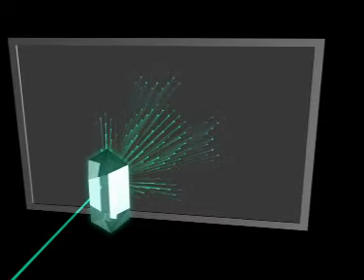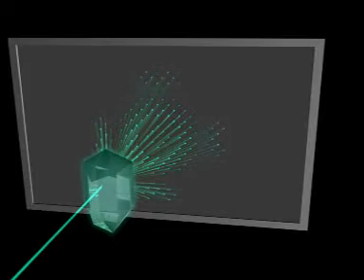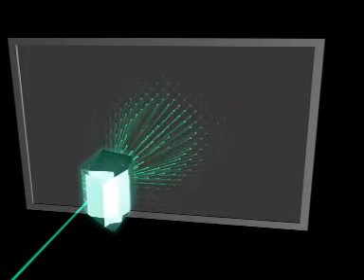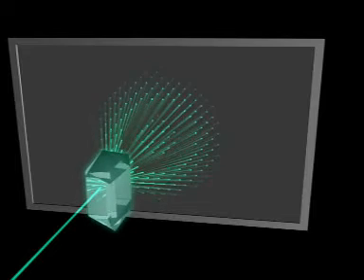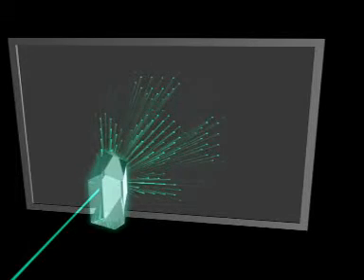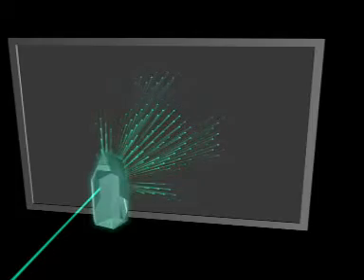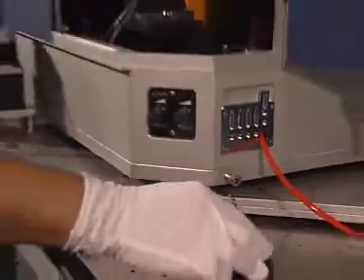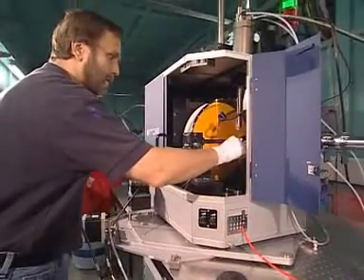In each of these hundreds of detection steps, the crystal is turned a small step further by means of the goniometer, so that a complete picture of the radiation distribution over the entire space, as generated by the crystal, is obtained in the end.